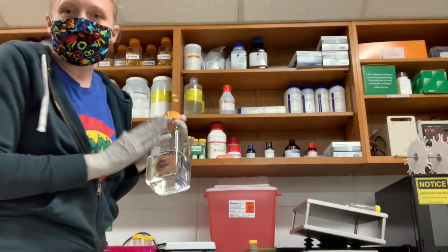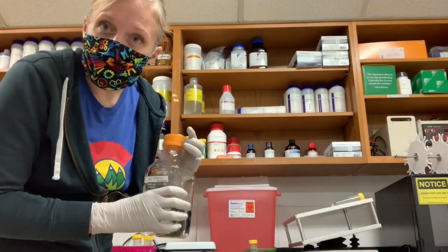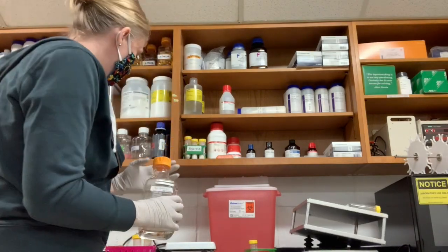And now I have DEPC water, which is RNase free, and I'm going to add it to 50 milliliters for each one of these tubes.